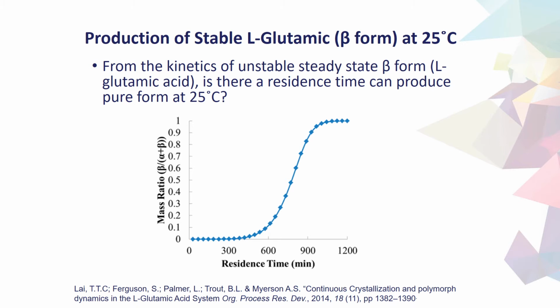What would typically be done would be higher temperature crystallization, but use a recycle loop to make sure that no yield losses are incurred for operating at these higher temperatures in order to control the form of the API that is derived from the crystallization.